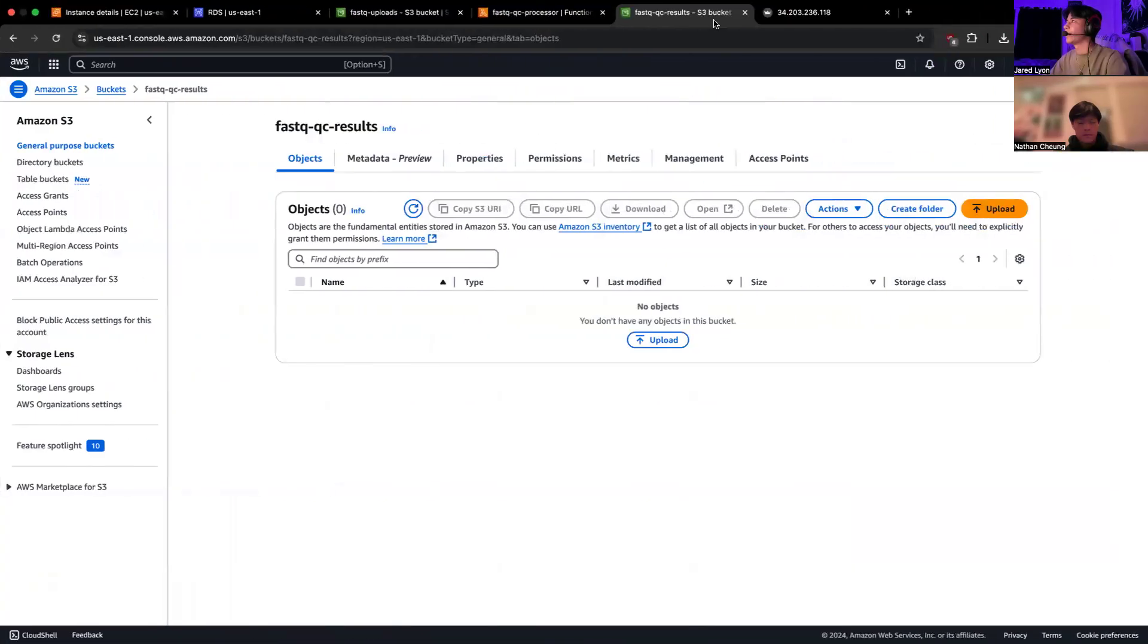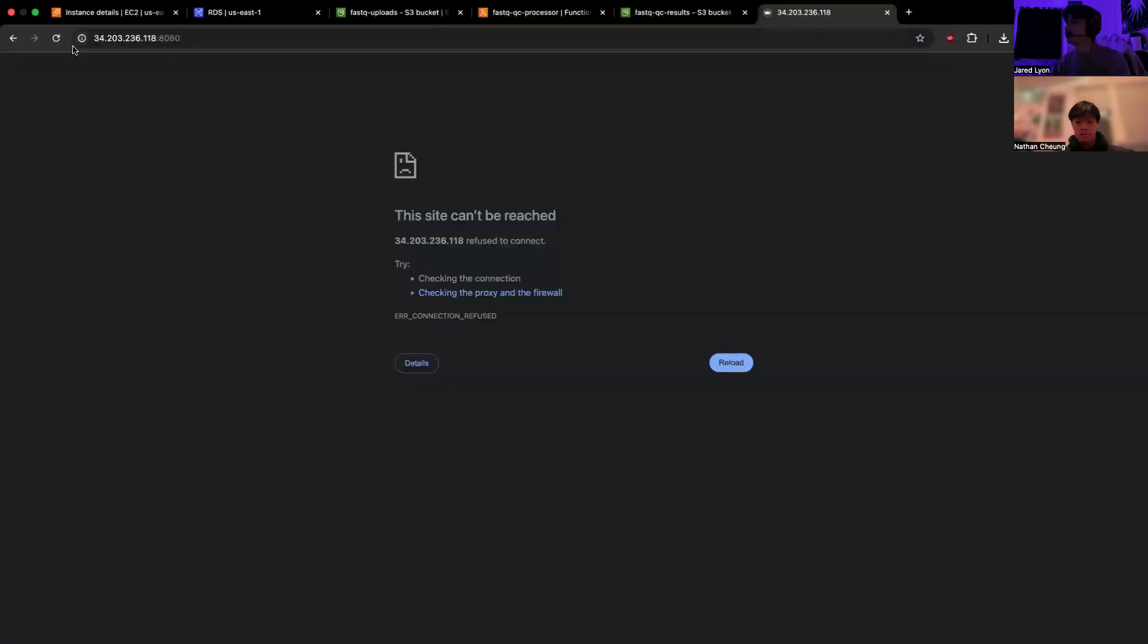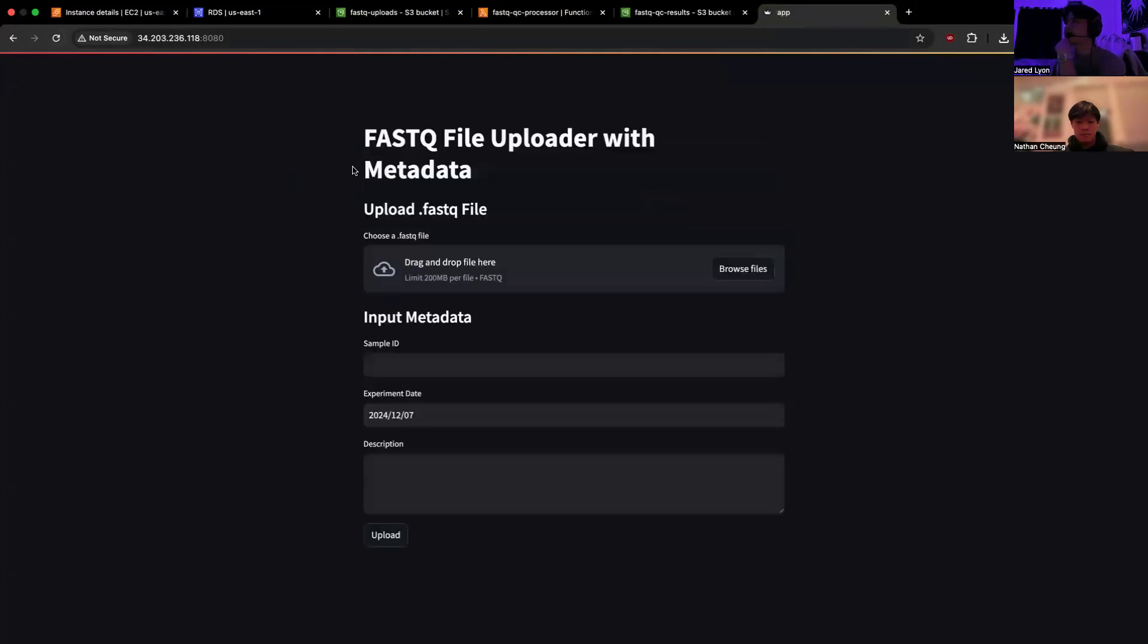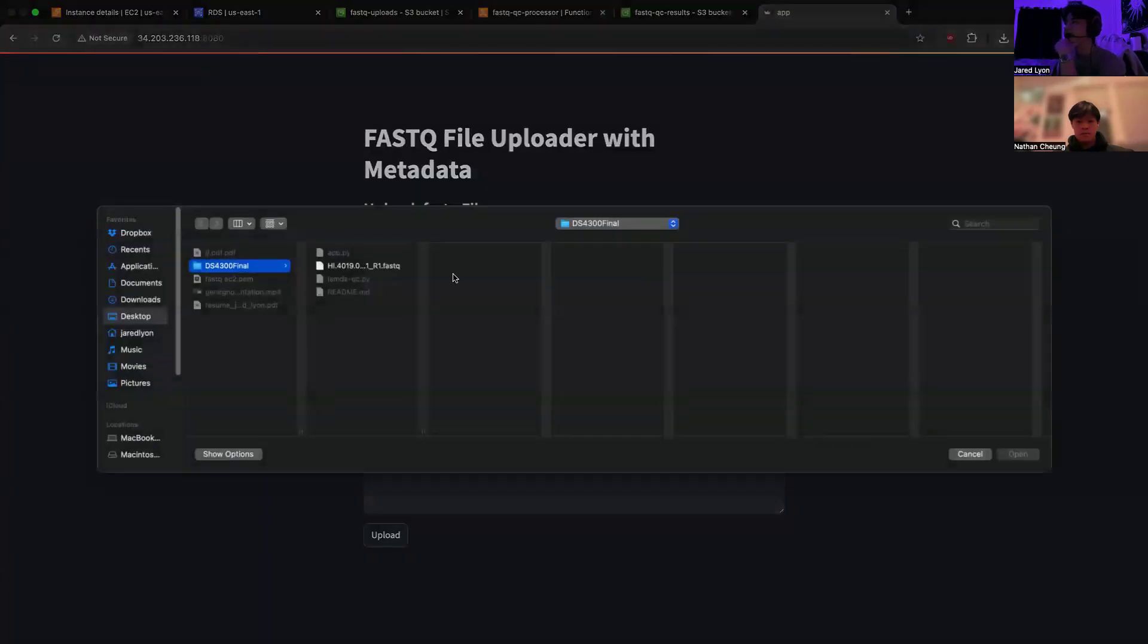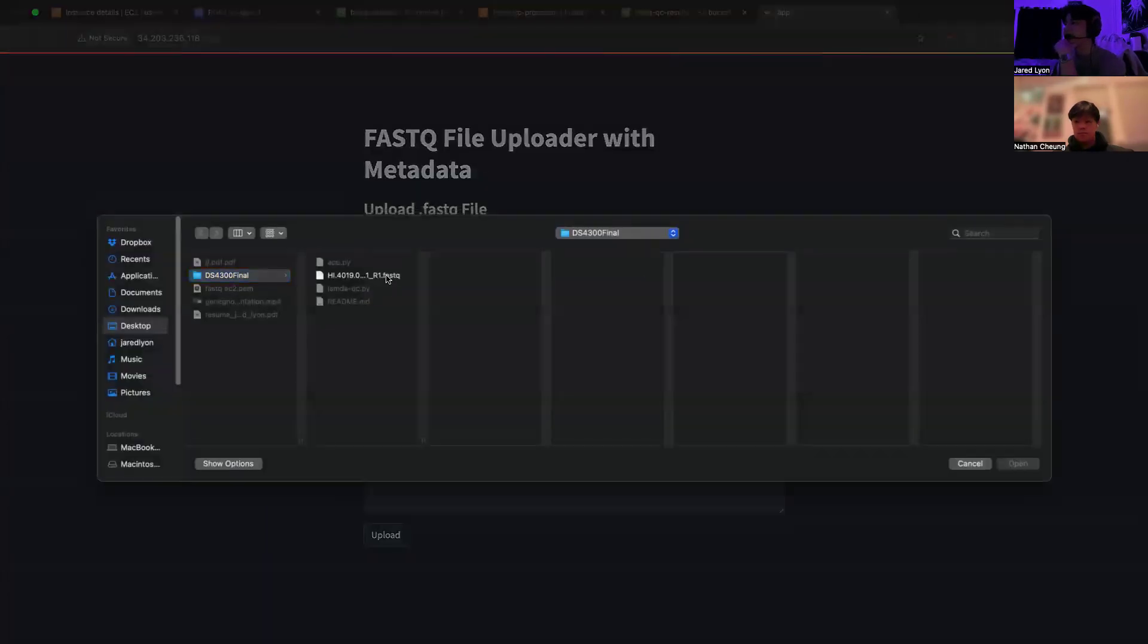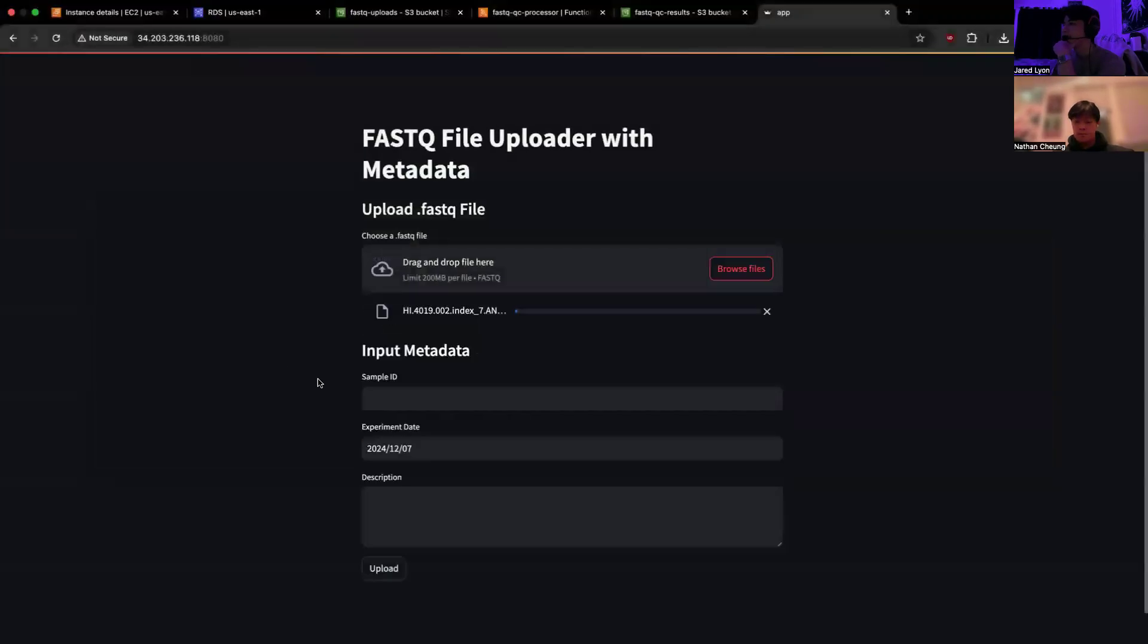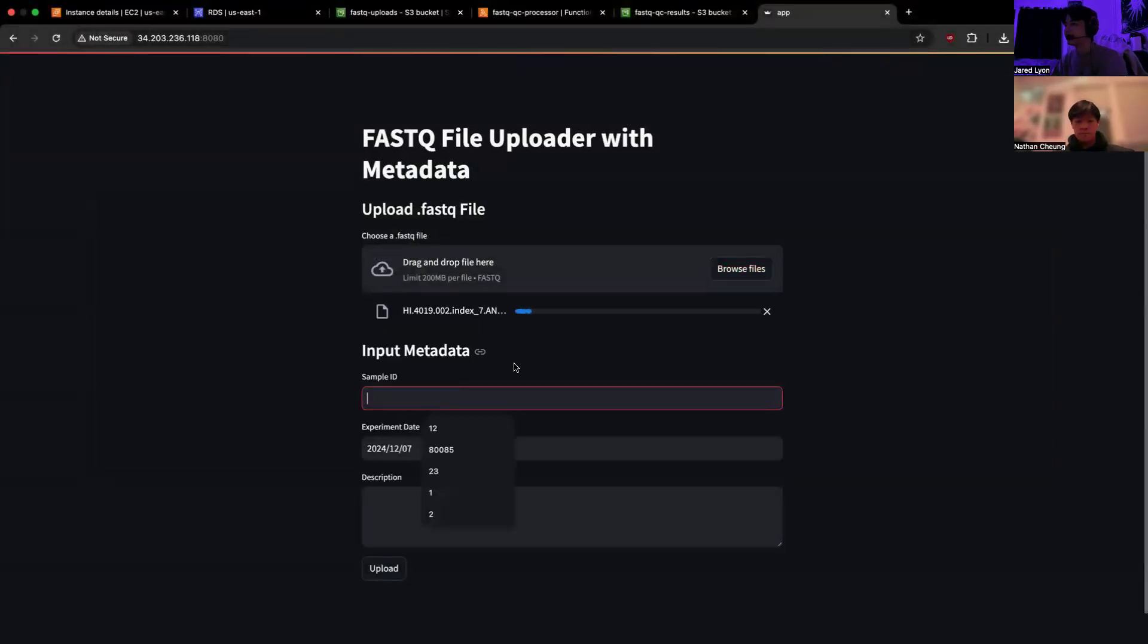So now we go over to our Streamlit app. And now that's running, we should be able to connect. Yep, we select our FASTQ file and then wait for that to upload.